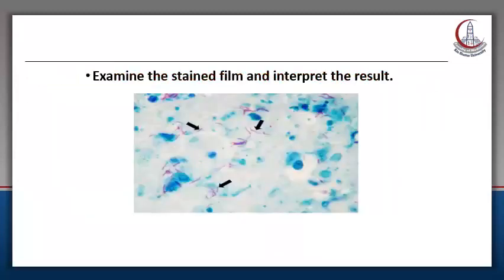As we discussed before, the sputum sample from a suspected pulmonary tuberculosis patient can't be stained by Gram stain, as Mycobacterium tuberculosis bacilli can't be stained by Gram stain because of their special cell wall content of lipid. It has a thick cell wall.